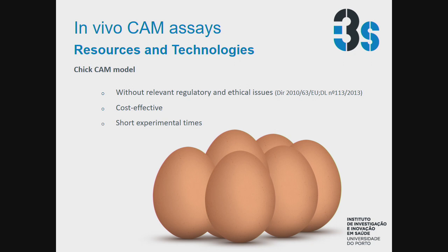As long as they don't hatch, and they don't, okay, there are no chicks in the lab, ever, just to keep that clear. And it's quite a cost-effective model because the logistics is really easy. Everything is inside the shell. You don't have to clean or change the house or anything else. You'll check in the afternoon when you go to the lab. And because we are always using the development time, experiments are quite short too. They will take a maximum of 3 weeks. Compared to mice, it's quite fast. So summarizing, it's affordable, fast, and you can have medium-high throughput using eggs instead of rodents.